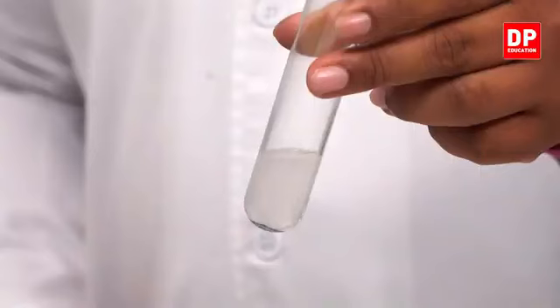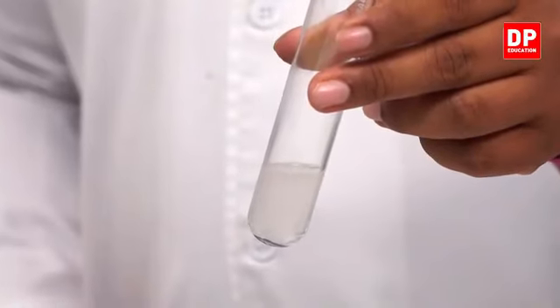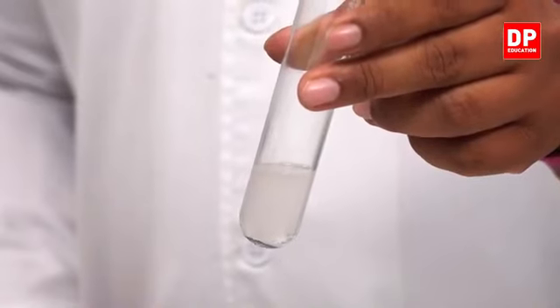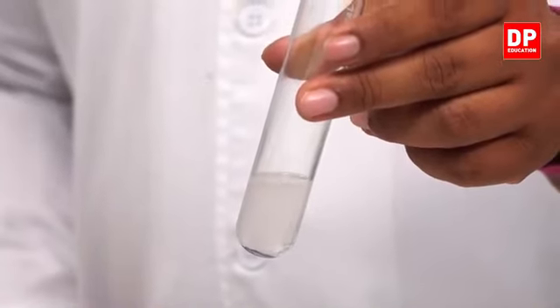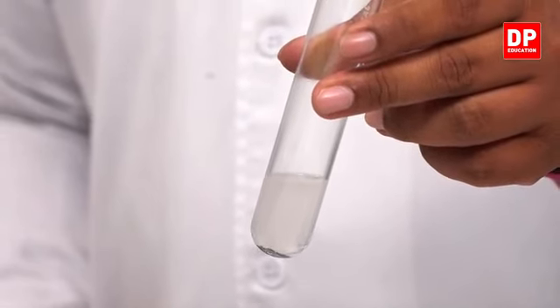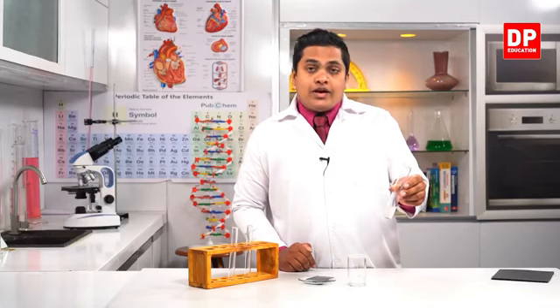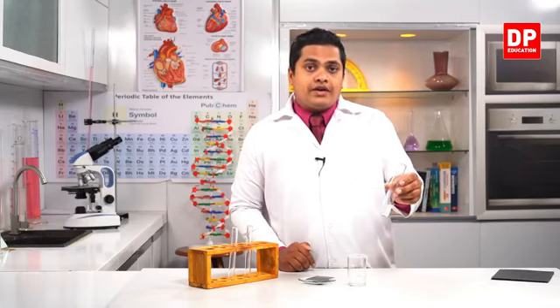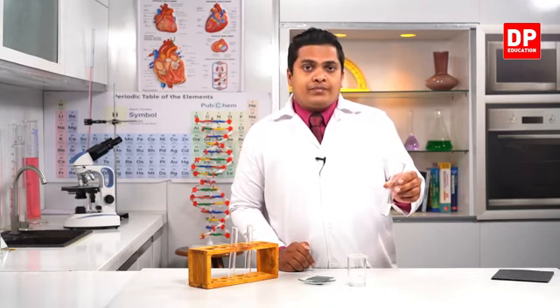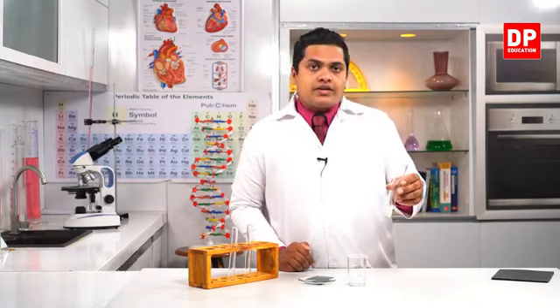So this experiment shows that formation of gas bubbles concludes that this system undergoes a chemical reaction. Right, so we'll head on to the classroom and we'll identify what are the changes, or what are the new things, what are the evidences that we can provide if there is a chemical reaction.